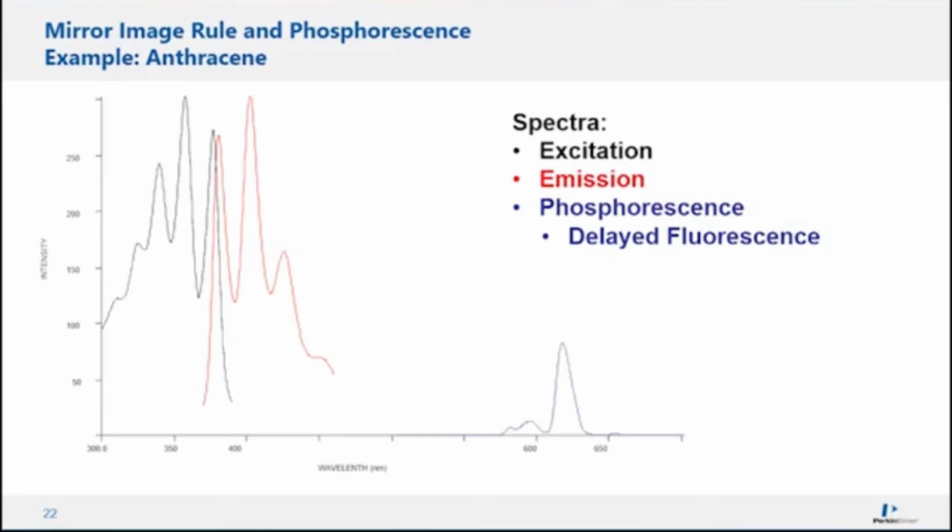And let me just pull those up here. I'm going to point to them on the screen. I'm going to mark this one in black. There's the black point, and then let me put the other one. This is the red point over here. So those would be the 2 points where we would measure the Stokes shift, and we would measure that in nanometers.